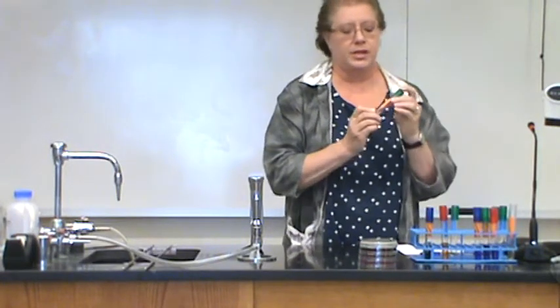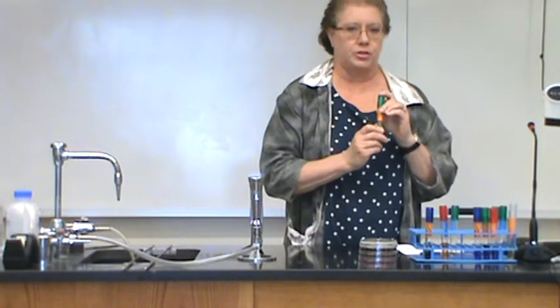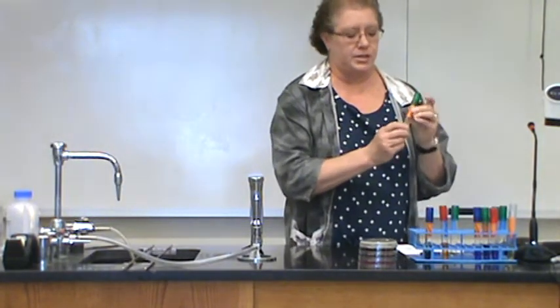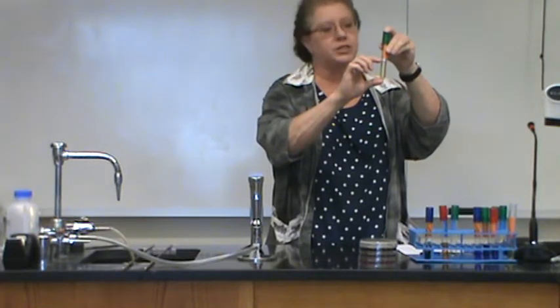So then you go on to a hydrogen sulfide test, which uses a SIM media. It's called a SIM media. This media can be used for other tests. We are only using it for the hydrogen sulfide test. This is again a semi-solid media, and it's kind of a deep amount of media in the tube so that you can see the reaction clearly.